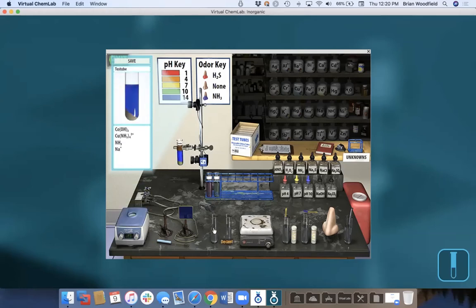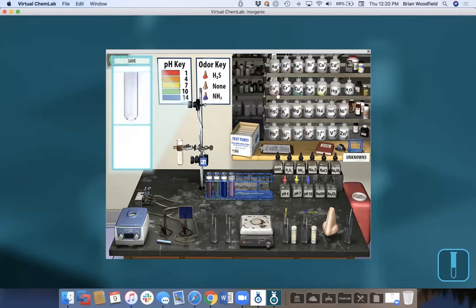So I'll centrifuge, decant, and so there's my copper, here's my cobalt, and I can go, hey, here's my pH 10, and I can add some carbonate and look at a cobalt carbonate and be able to learn all of this chemistry. So I want to show you some other real stuff. It's common for some people to say that we have an error, that we may have some bugs, but in terms of the algorithm for this, it isn't.